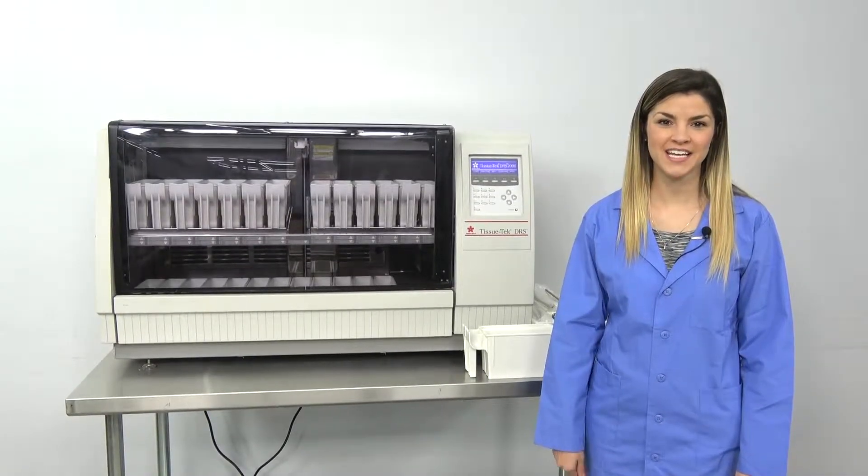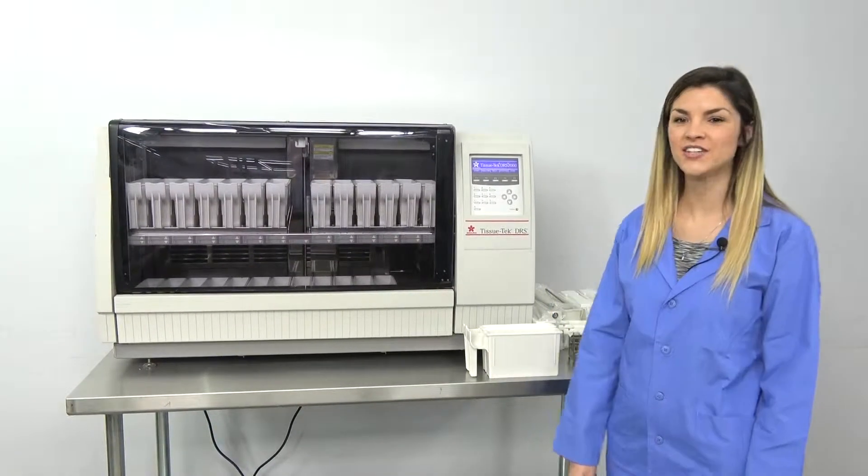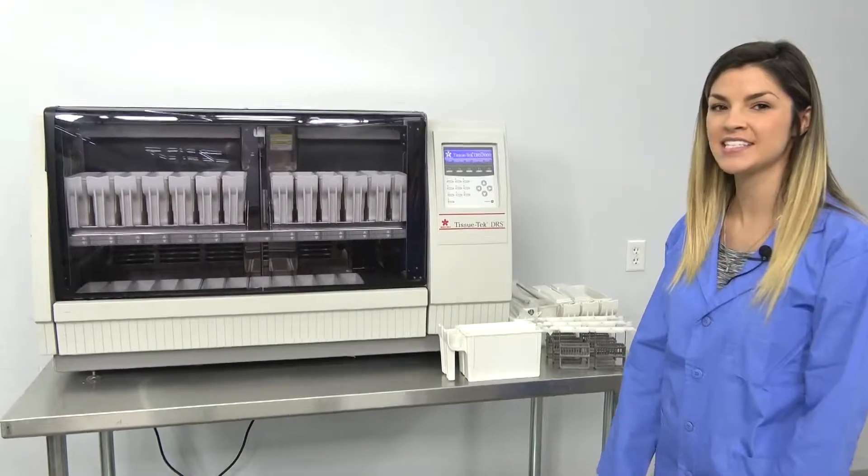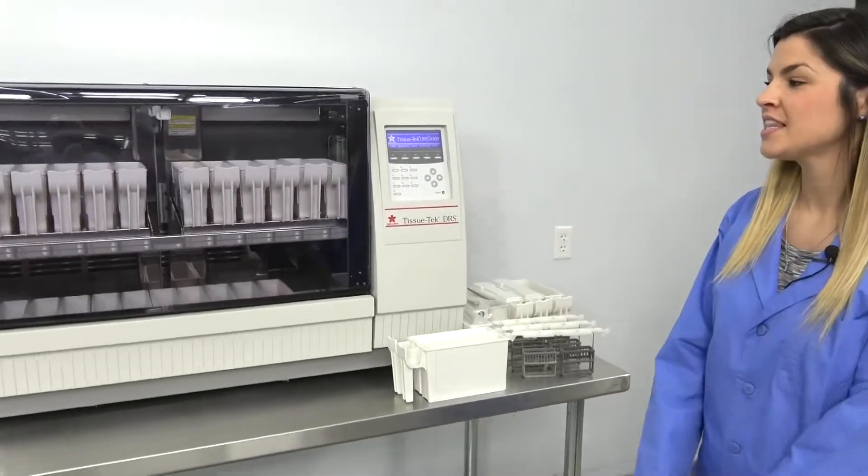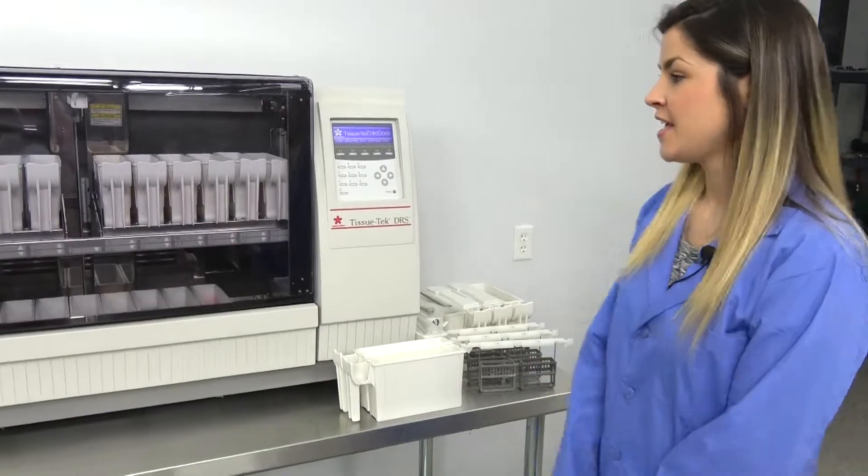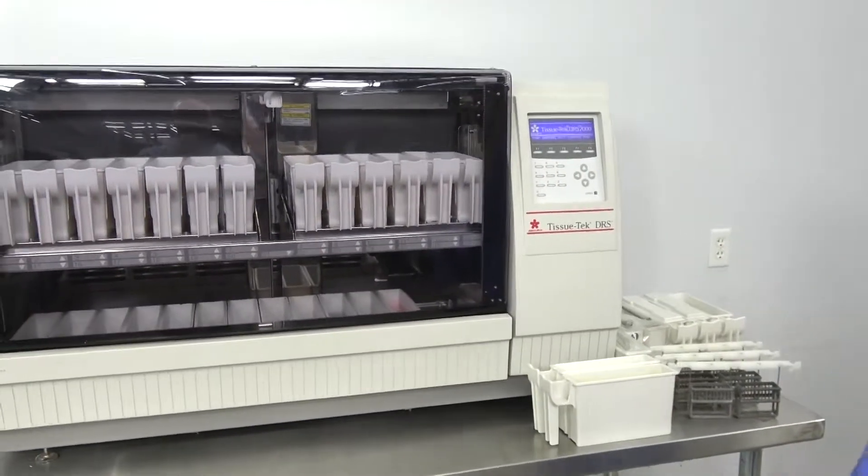Hi, my name is Heather with New Life Scientific and today we're going to take a look at the Secura Tissue Tech DRS-2000. This is a fully automated slide stainer and it is extremely user-friendly.